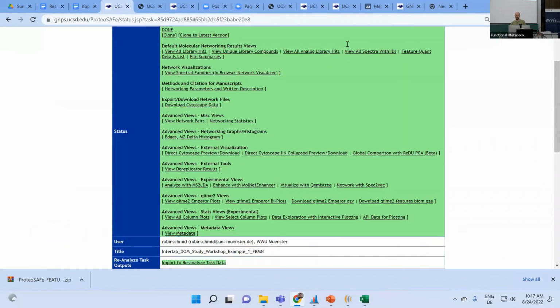Again, tomorrow, Madeleine and Francesco are going to walk you through exactly the same analysis in R, and they're going to explain this way more in detail. But just so you know, you can do that also quickly in GNPS. Okay, question?